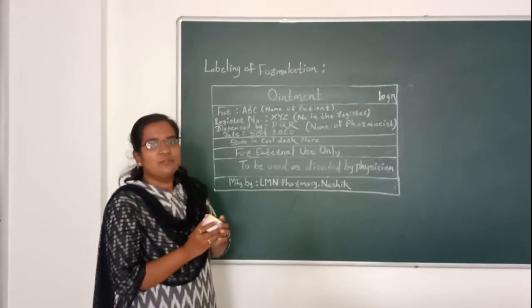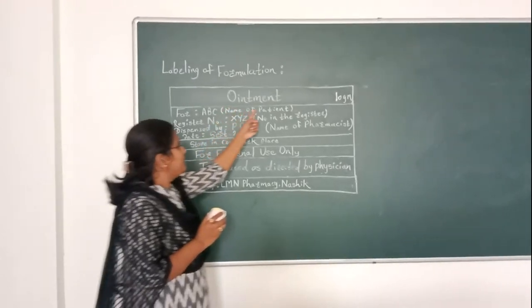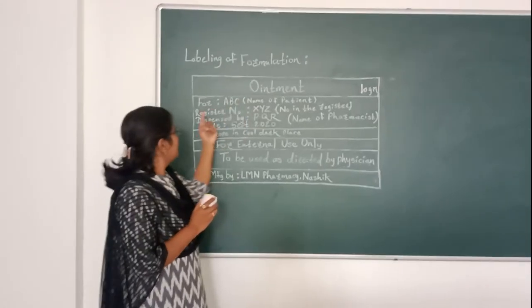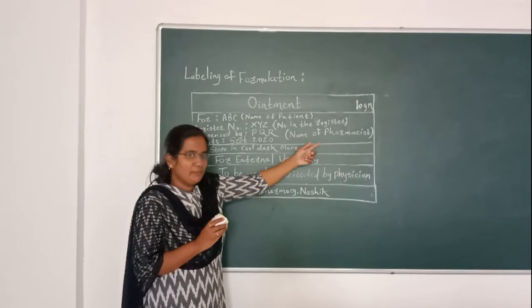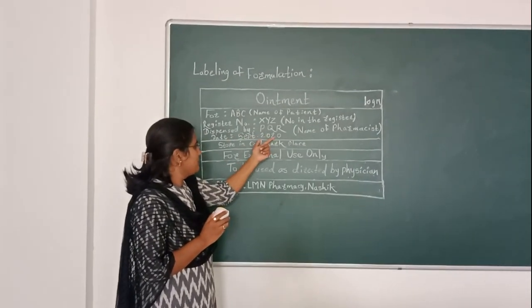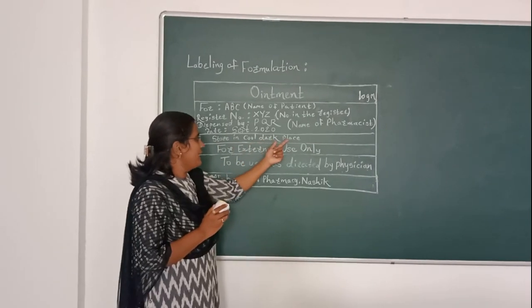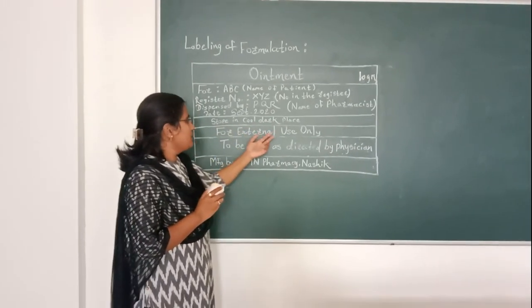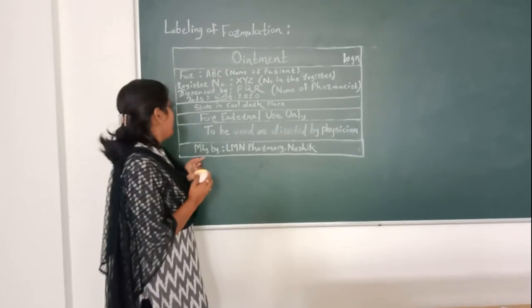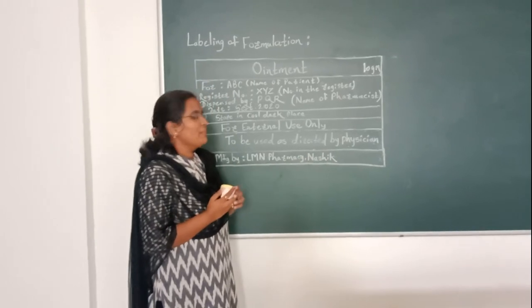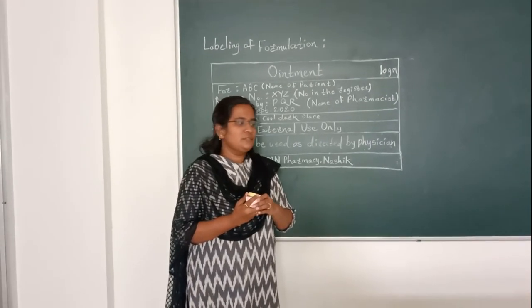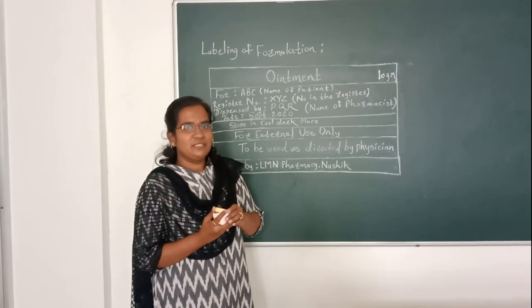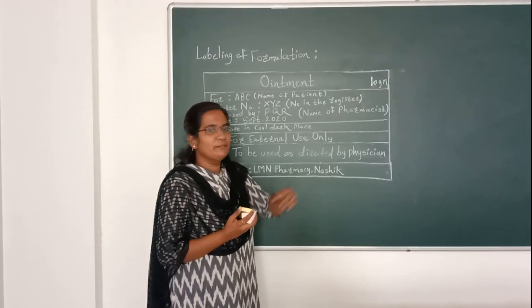After proper mixing, we transfer the ointment into the container and proceed to the labeling part. The label includes: name of patient, register number, name of pharmacist, date (September 2020), storage condition — store in a cool place — and instructions for external use only, to be used as directed by physician. Result: 10 gram of sulfur ointment is submitted in a wide-mouth jar for inspection, with special instruction on the label: 'For external use only.' Thank you.